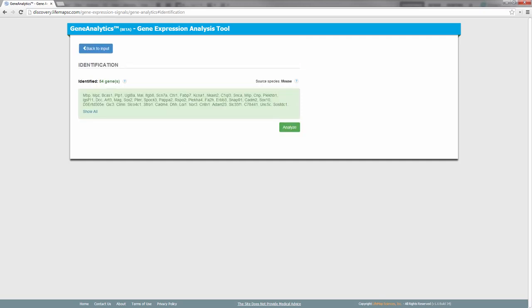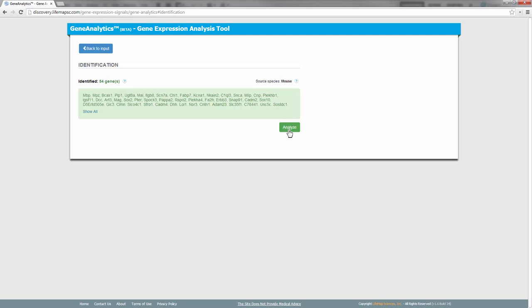As we can see, all the genes in our list are identified. Let's click on Analyze to get results for this gene set.